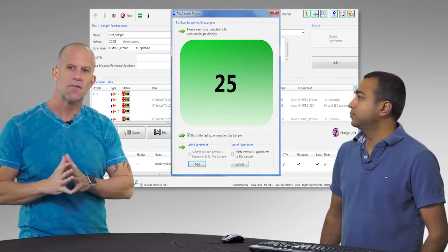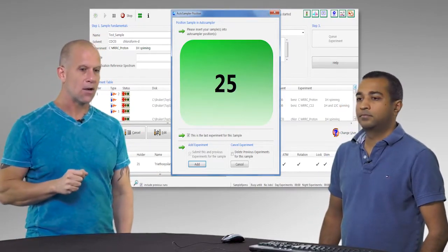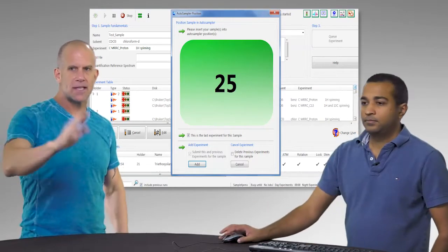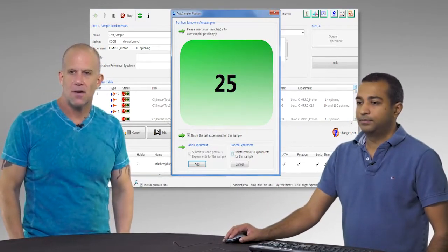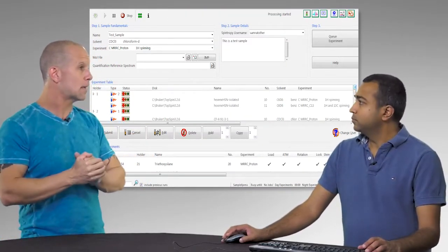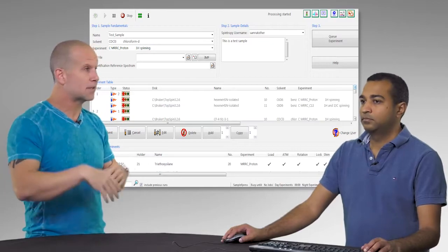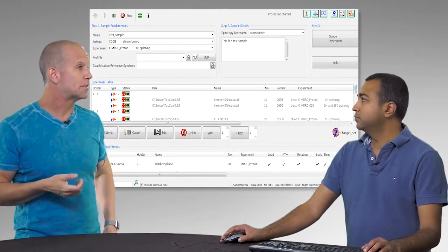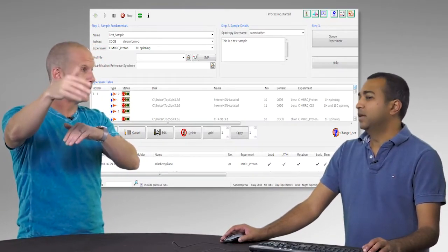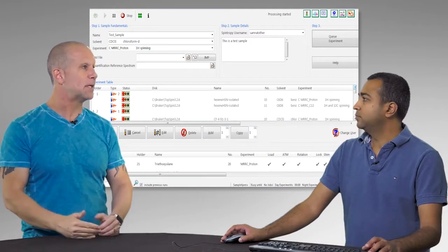And we'll have a separate video in the magnetic resonance center that walks through the hands-on putting something in there. Right. So let's just assume we put the sample in, it's run, et cetera. I think it is worth covering. So we would just hit add that, and as soon as it's added, within a certain amount of time, if it's just a short proton and there's nothing queued in front of it, literally it could be 10 minutes after we submitted it. If you run a complete structural thing, it might even run the proton within the first 10 or 20 minutes and then overnight queue a lot of the 2Ds. But you will start populating your data in Spintropy.